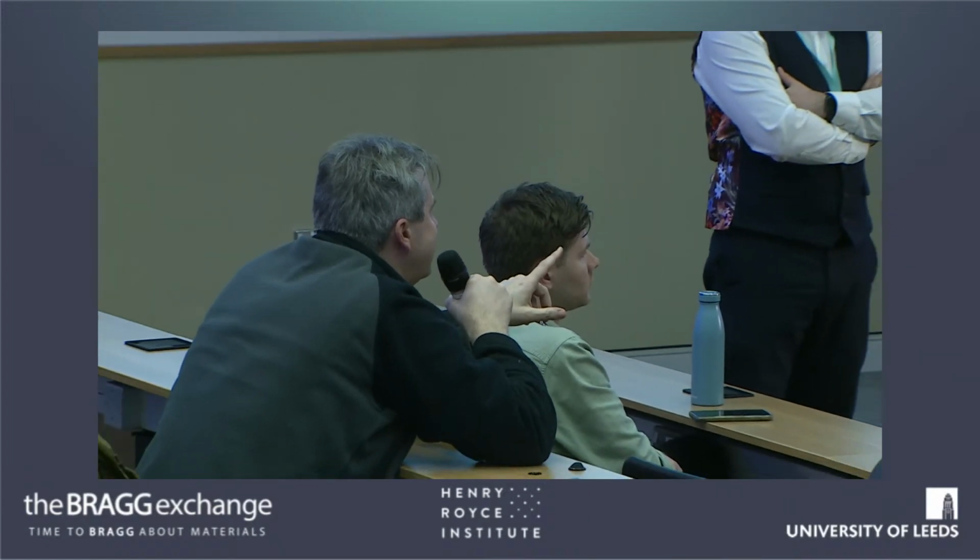So I've got two dead quick questions, I hope. First of all, I don't think you mentioned what the tip material is. Is it just a standard tungsten? Yes, it is, yeah.